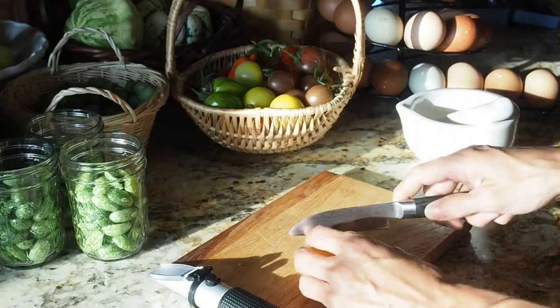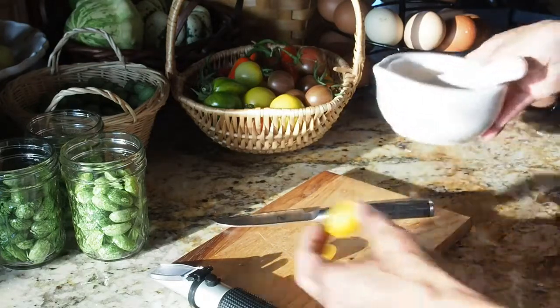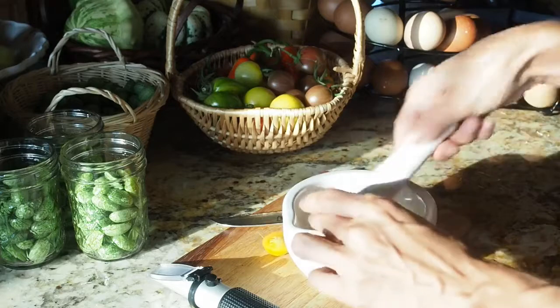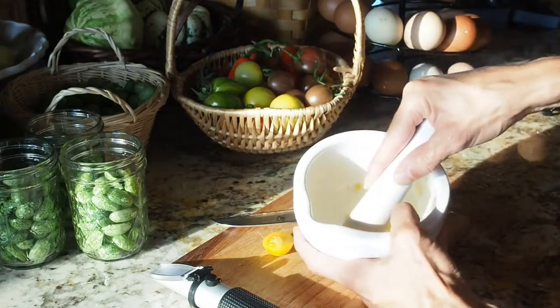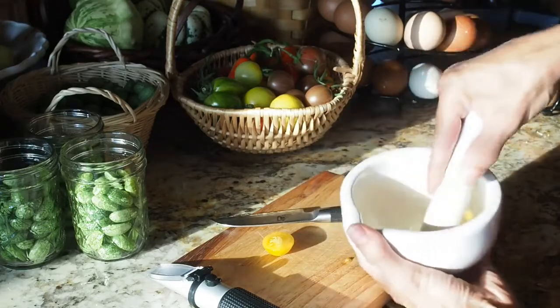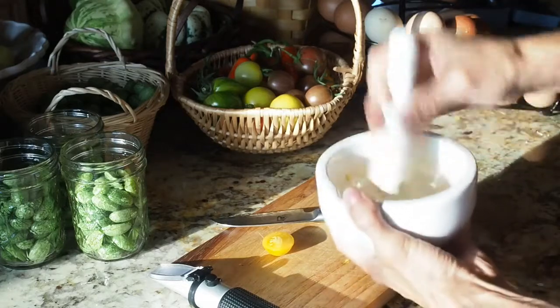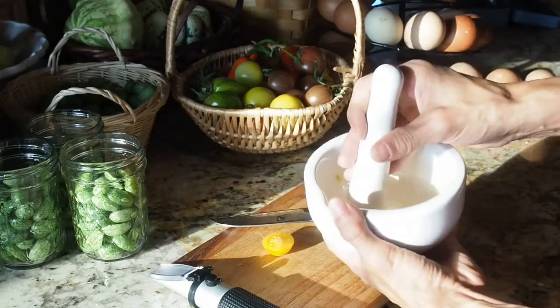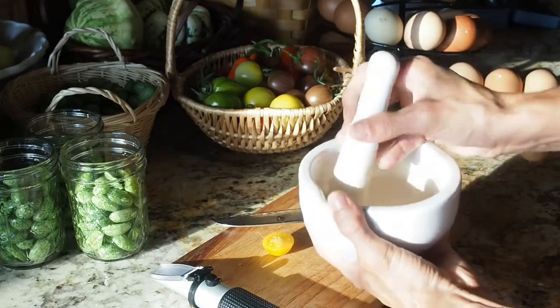To do the test, we're going to cut the tomato in half and then use a mortar and pestle to crush it up. I want to just get it squished as much as I can. You can also use, if you don't have a mortar and pestle, either a blender or a food processor.